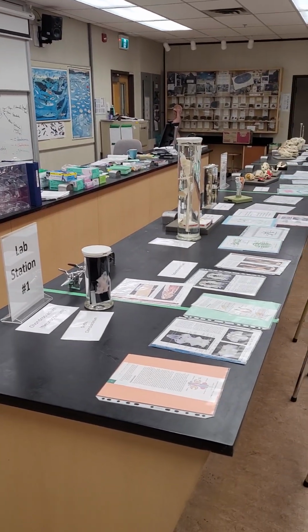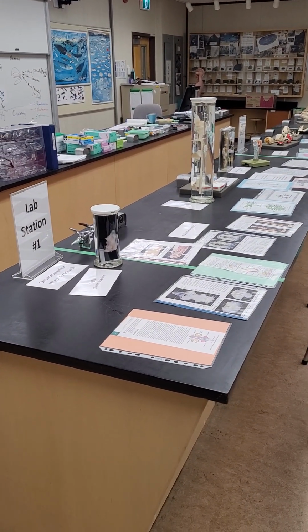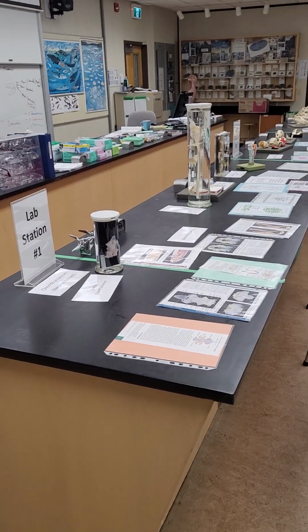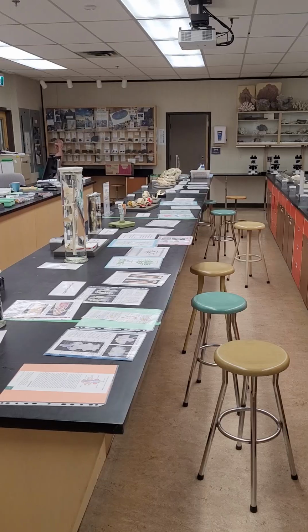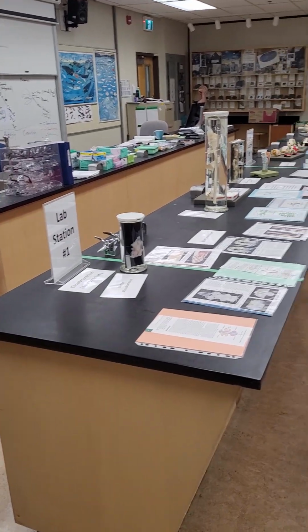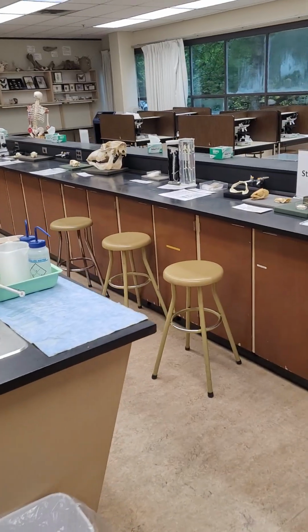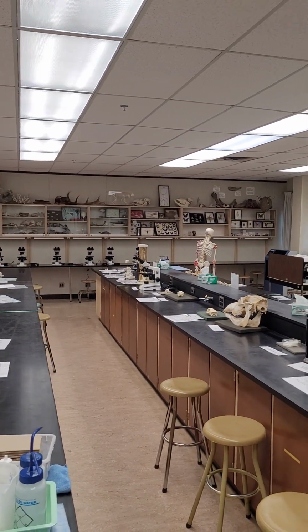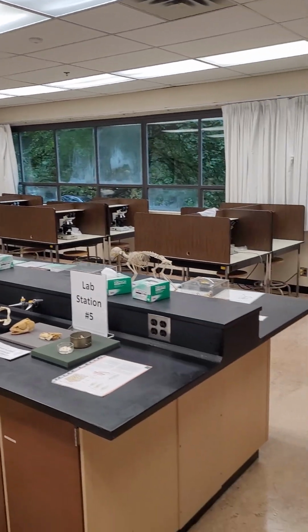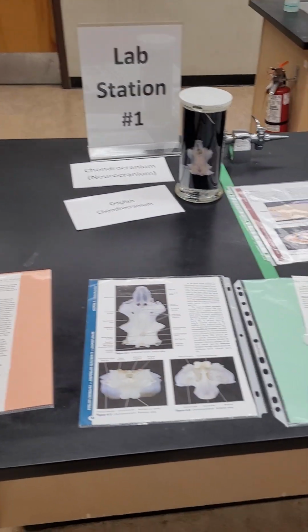Okay, this is the BIOL 213 Vertebrate Zoology Skeleton Lab, and we will be following the theme, which is broadly around the axial and appendicular skeleton. Within the axial, we'll start with the skull and the story that occurs here, and then we'll deal with teeth before moving to the axial vertebrae, and then down into the appendicular skeleton and the skeleton overall. So we start here with the cranial skeleton.